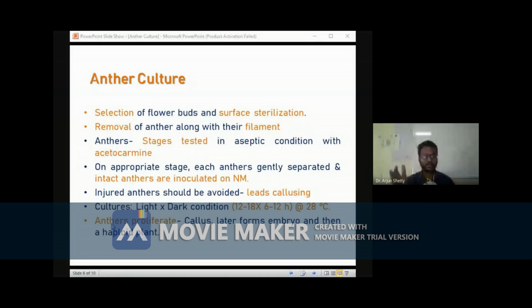The flower may be carrying contaminants such as microbes, bacteria, fungi, or some other microorganisms which have to be removed, because when we are talking about in vitro culturing of anything, the main step to be employed is the removal of surface adherent microcontaminants.